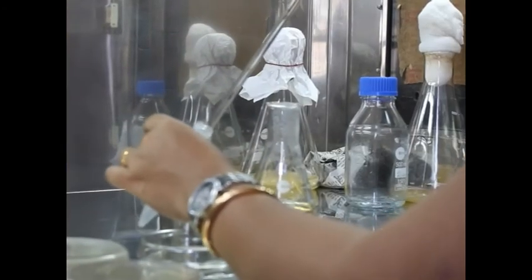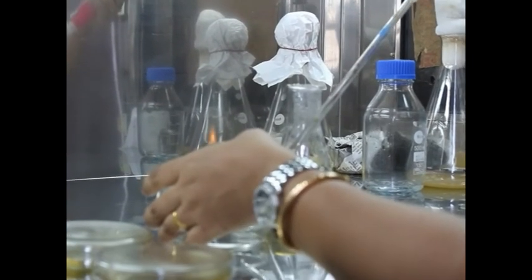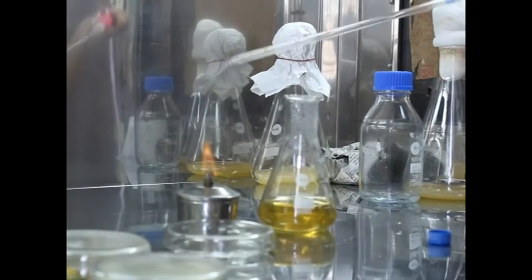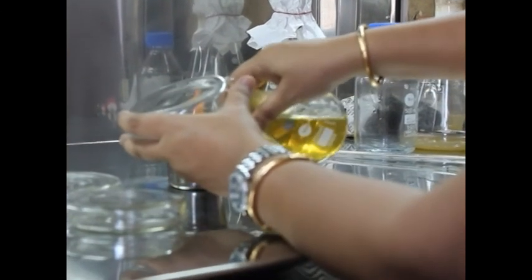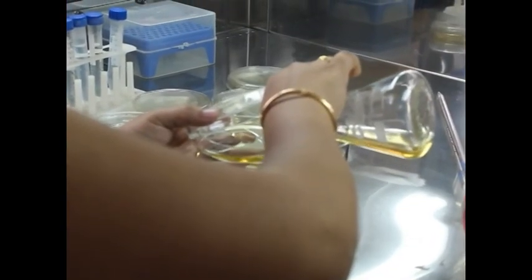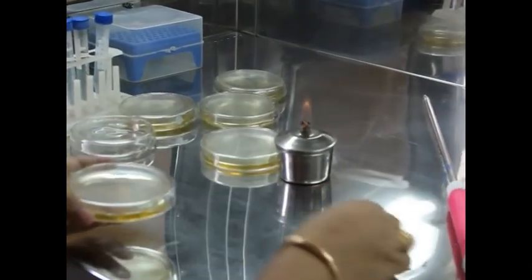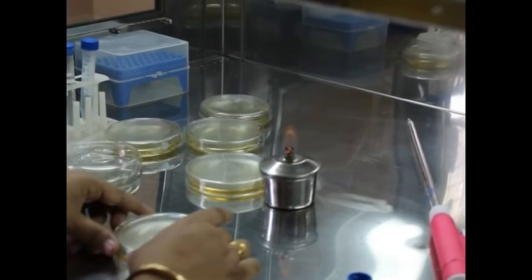Then 1 ml of the bacterial suspension is transferred to the labeled Petri plate. Then the lid of the Petri plate is slightly lifted with the left hand and the sterile molten agar is poured on the plates. Then the dish is rotated gently to mix the culture and the medium thoroughly and to ensure that the medium covers the plate evenly.